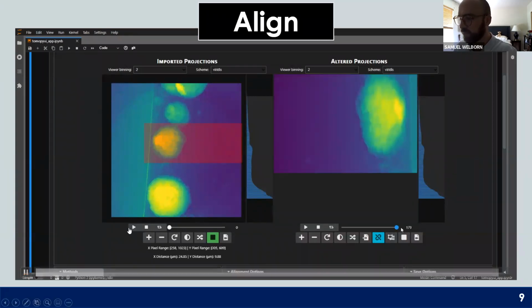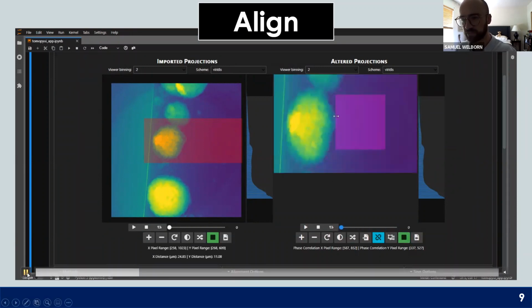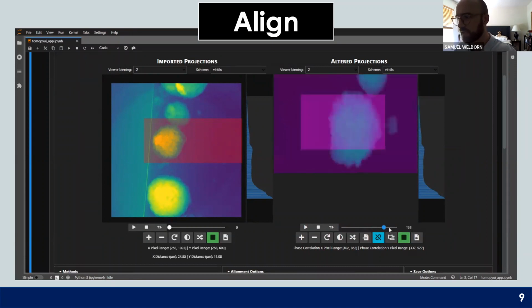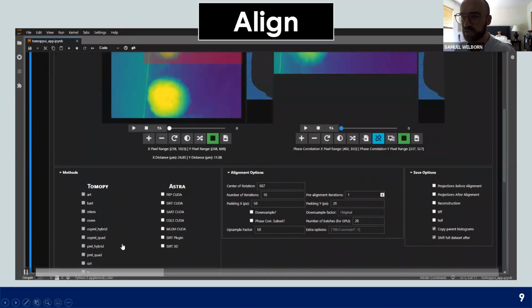So what is good about this particular way of doing this within TomoPyUI is that I can crop the data set to what I want to reconstruct. This not only makes this a faster process for the actual reconstruction, reprojection and phase correlation matching, it is important for the actual automatic alignment because you might not want to include part of that data set in this.